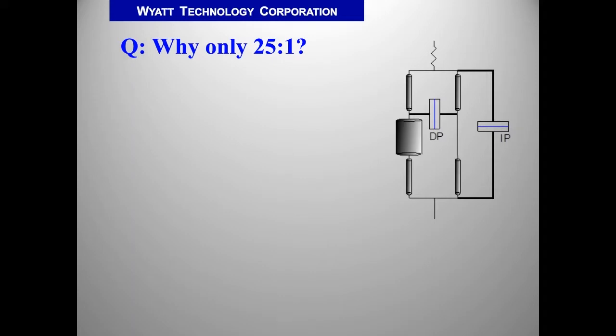For many years, this was not widely appreciated: the symmetry of the bridge, namely, if you think about it without that big holdup volume, it would be perfectly symmetric. You'd have 2 capillaries on the top and 2 capillaries on the bottom, and you should get perfect cancellation.